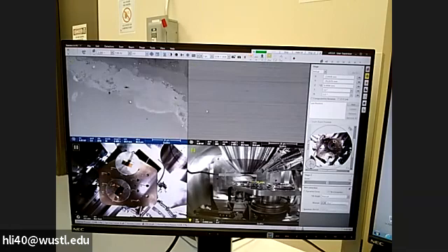So now we are done with this sample. We can go to the next sample. Just watch out if you happen to have a different height of sample. I would suggest users use the same or similar height; the difference is best less than 1 millimeter.